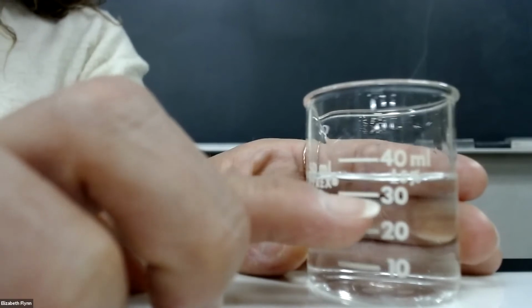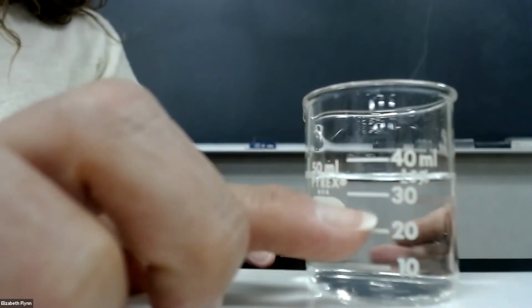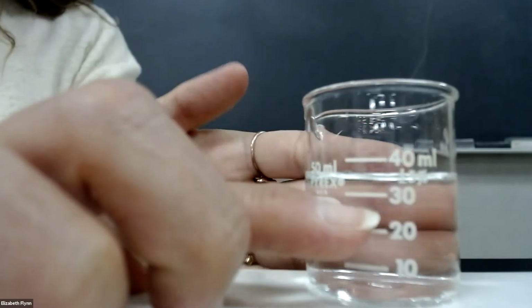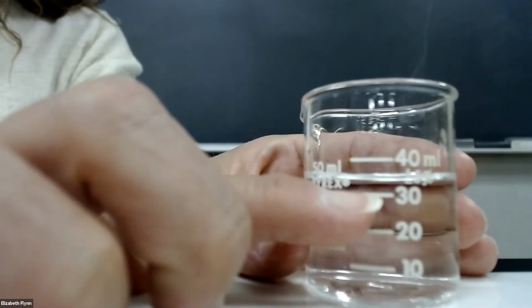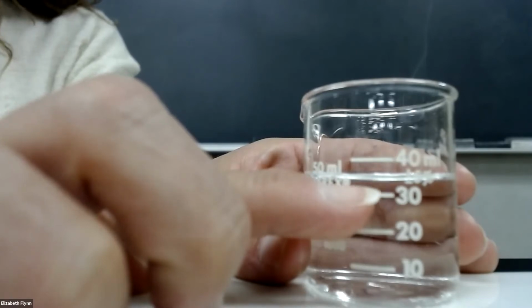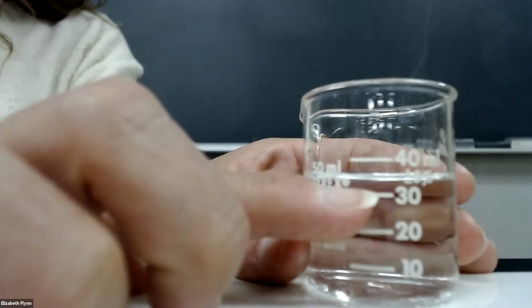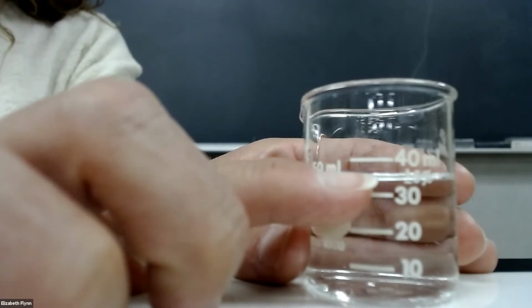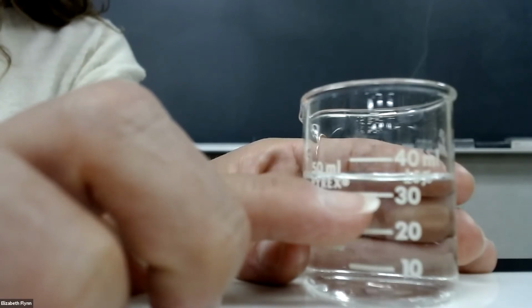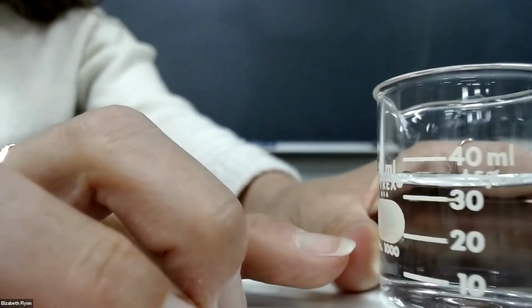So we know it's 30. And then what do we think? The bottom of the meniscus, making sure that we have a surface behind the beaker, kind of blocking the light. What do we think? 30 what? Sure. I would take 34. I would take 35, but not 34.5, because remember, we're estimating the 4 or the 5. We are estimating 34 or 35. So why don't we just say, let me see, I'll say 35. Oh yeah, there we go.